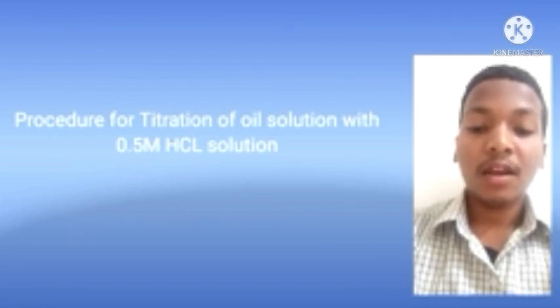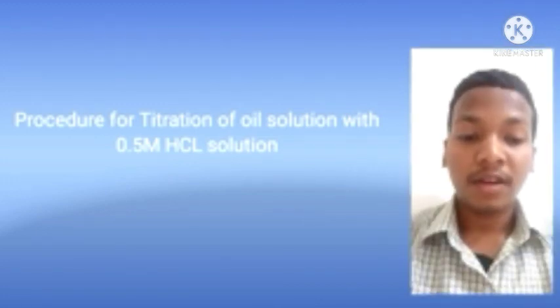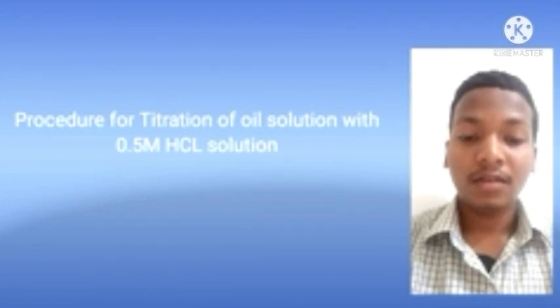Step 3: now fix an air condenser in the mouth of the round bottom flask tightly. Wet the paper flap of the air condenser with water.